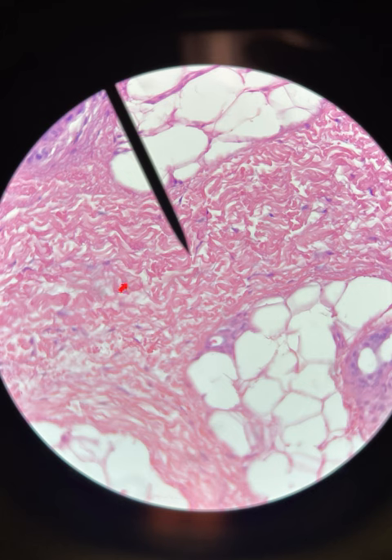It's not in parallel sheets. We actually have this wavy appearance. So this is dense, irregular connective tissue, and this is found in the fascia and other places, but we're just going to stick with one thing so you can really focus on it for your test. It's found in the fascia, and it resists pulling force. It resists force from many different directions. That word many is going to be our big difference between dense irregular connective tissue and dense regular connective tissue.